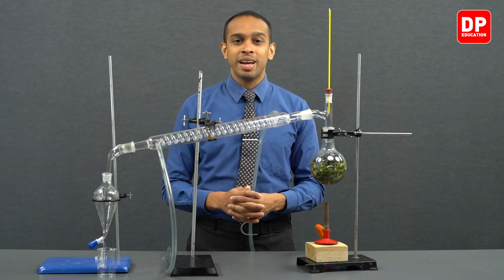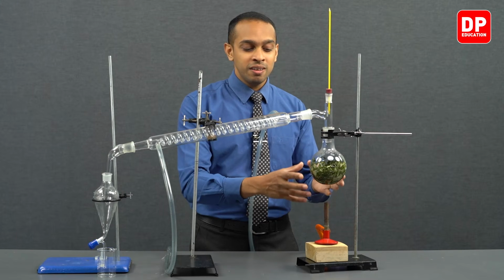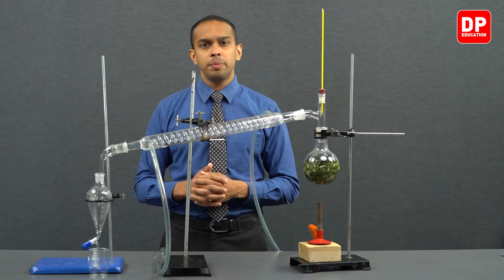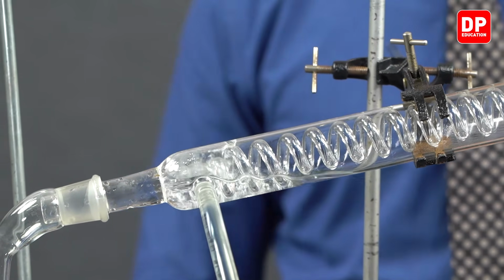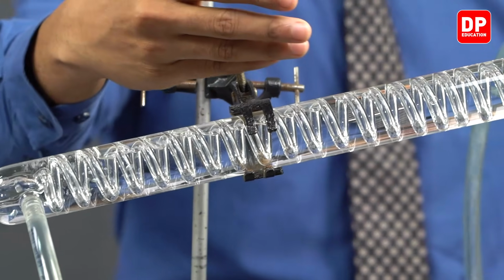Now we can actually move on to lighting this Bunsen burner and carrying out this essential oil extraction. Now we will be turning on the tap and we'll be allowing the water to flow from this tube, and you can see the condenser is getting filled.